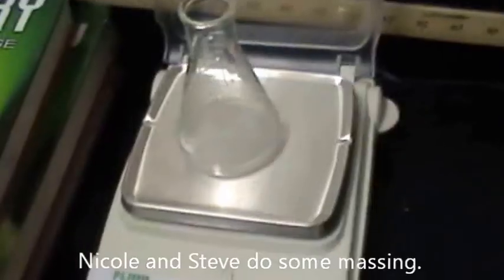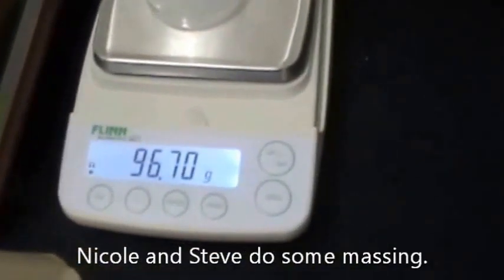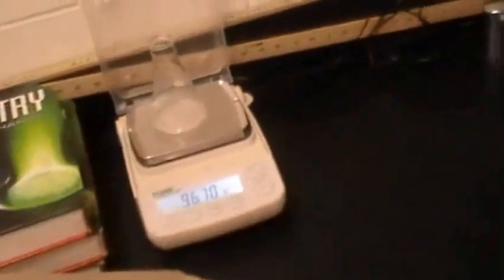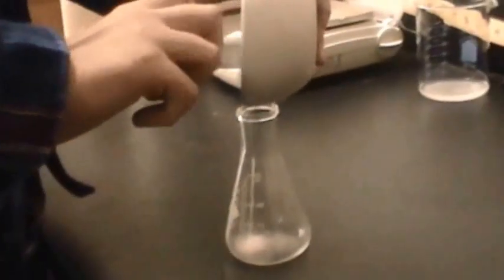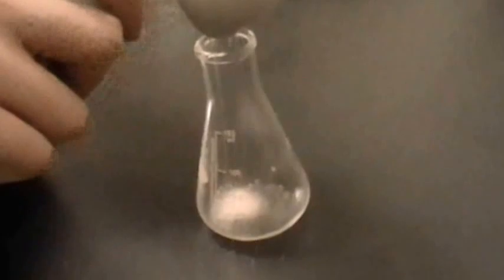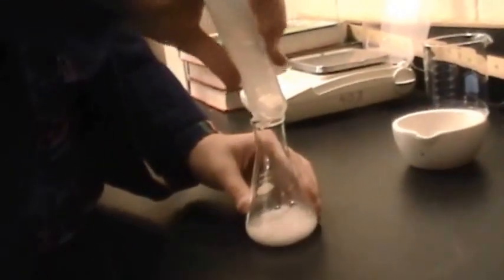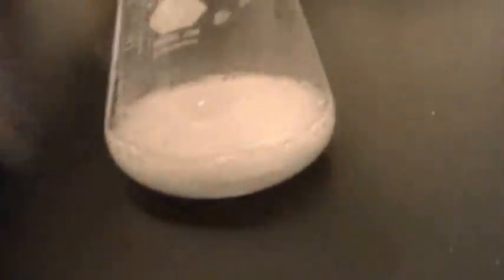We're starting over and we hope for the best. It's weighing at 96.7 grams, so we are measuring the amount of CO₂ released. Nicole is pouring in the calcium carbonate into the beaker, then pouring in the HCl into the beaker.